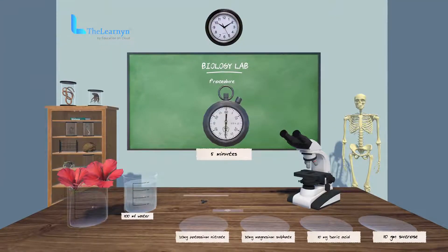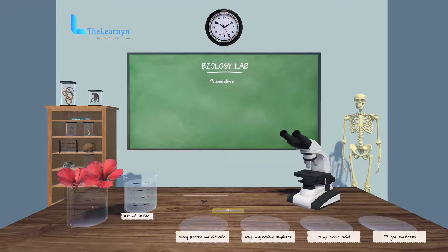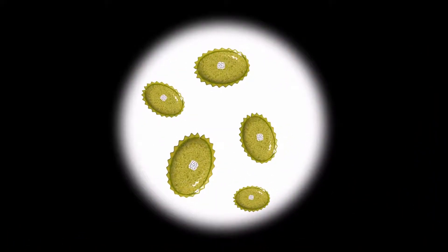After five minutes, place the glass slide on the stage of the compound microscope. Observe the slide through the microscope regularly for about half an hour.